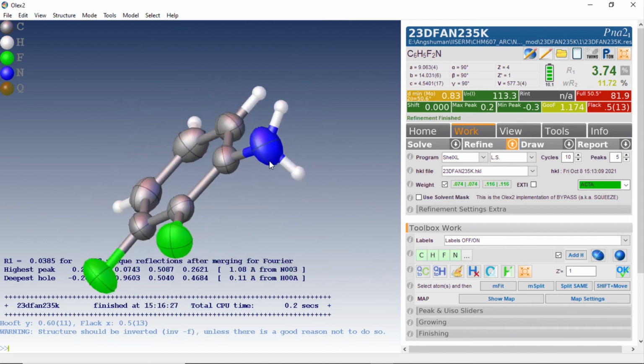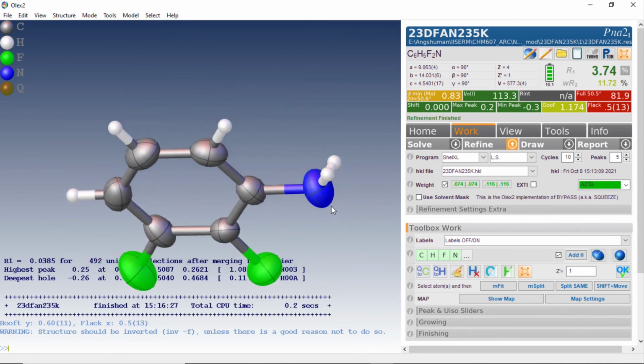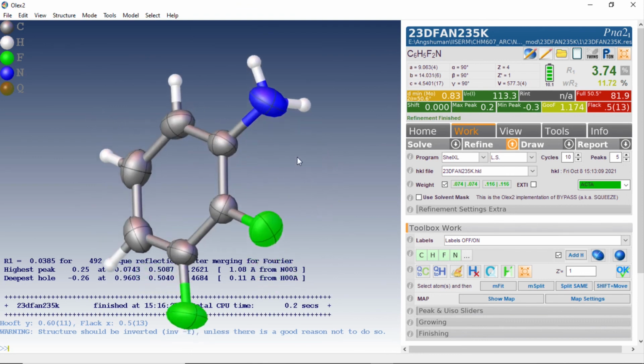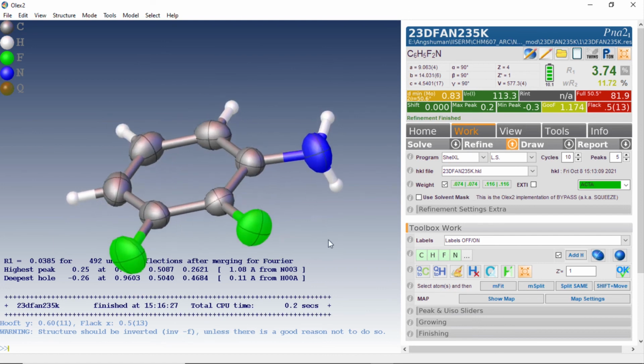You can use this method to segregate the reflections coming out of two different crystals, then reduce the two different data sets separately, and then join one data with the other using the X-ray package available within the Bruker diffraction software. So hope you have learned something, and it will be useful for all of you.